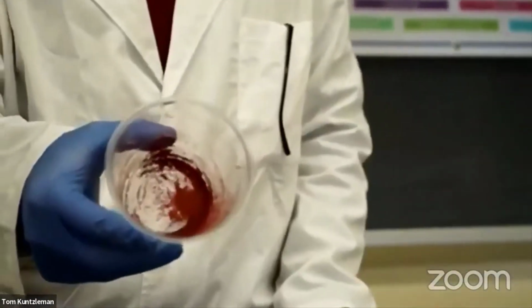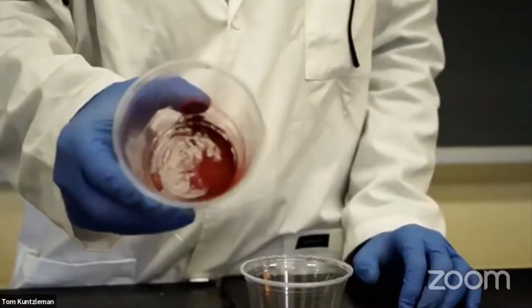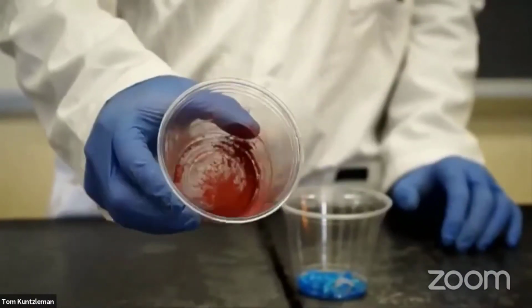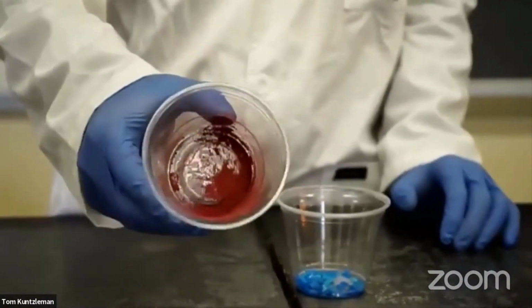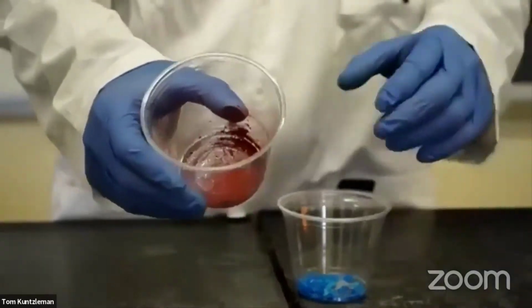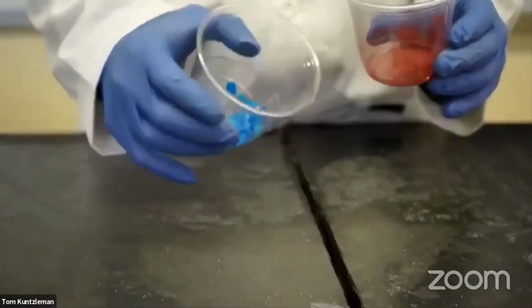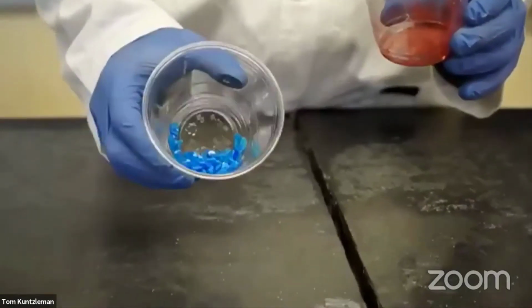It's a little red in color, isn't it? Maybe a little bit orange. And that's what we normally see when copper forms a +1 compound. It gets an orange or a reddish color. But copper can also form a +2 ion. And when it does that, it forms beautiful blue colors.